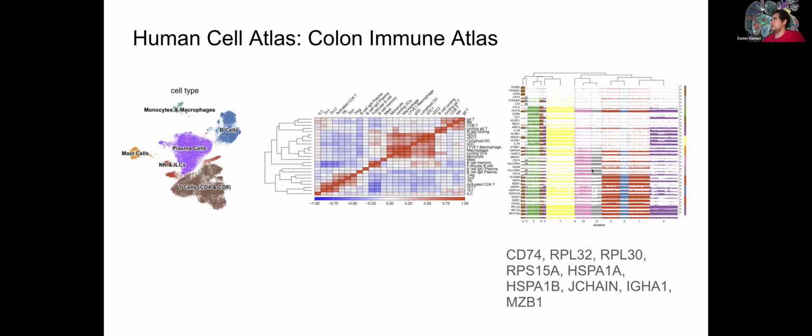And then in the pink, gray, red, blue, and purple, you can see that sort of the same genes and the levels of RNA transcript expression there. In the cell types, you can see from monocyte to dendritic cell, innate cells, higher activity here. And then in the B cells and NK and T cells, you can see higher expression there. And then some Th1, Th17, as well as activated CD4 T cells.